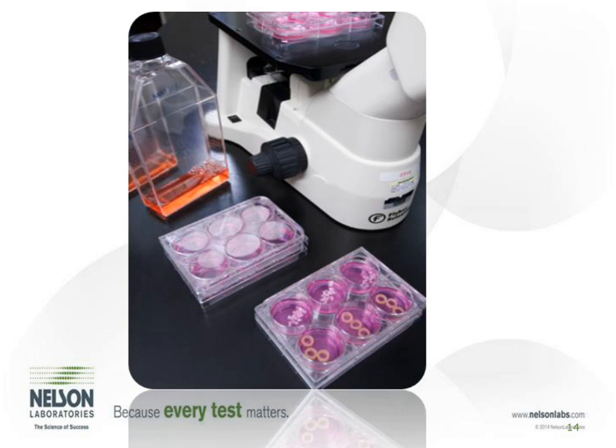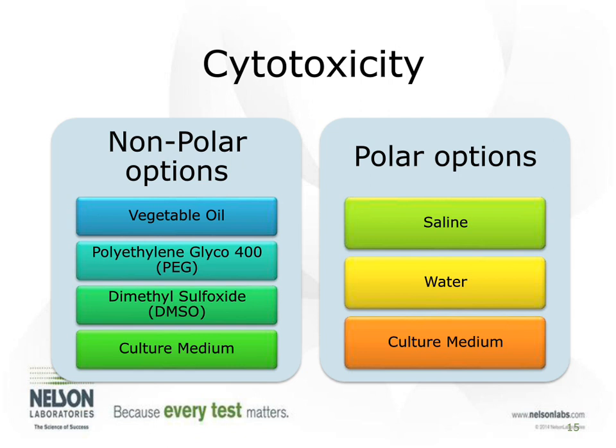The other thing I wanted to talk about with the MEM fluid a little bit is that the ISO 10993-12 standard says that we have to extract both in a polar and nonpolar media. For those of you that don't really understand polar and nonpolar, it's just, I love salad, so I always go to the vinegar and olive oil. When they don't mix, they separate, just like water and oil don't mix. So the oil is nonpolar, and the vinegar or water is polar. And so nonpolar and polar compounds do not mix. Well, there are some chemical compounds that are lipophilic or lipophobic, which means they'll either come off in oils or they'll come off in water.